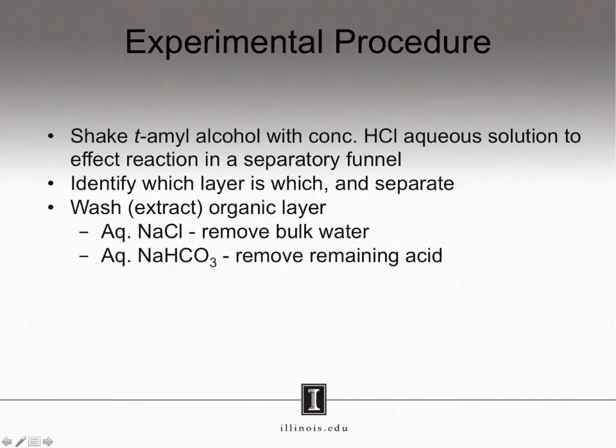Once you have performed these two washes, these two extractions, you will then take the organic layer and completely dry it using drying agent, like you did in the extraction experiment. And finally, you will purify your product via a distillation. At the end of the reaction, it is likely that you'll have a mixture of at least your product and unreacted starting alcohol. You will use distillation to separate them.